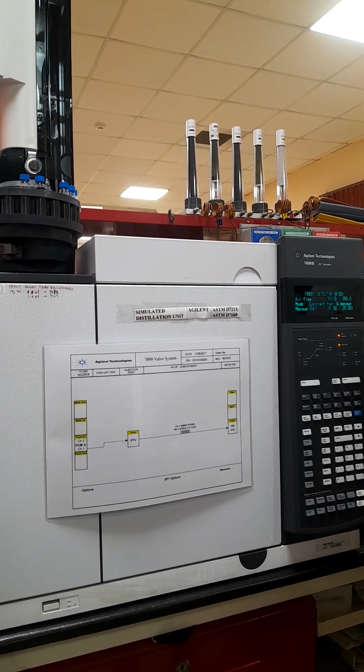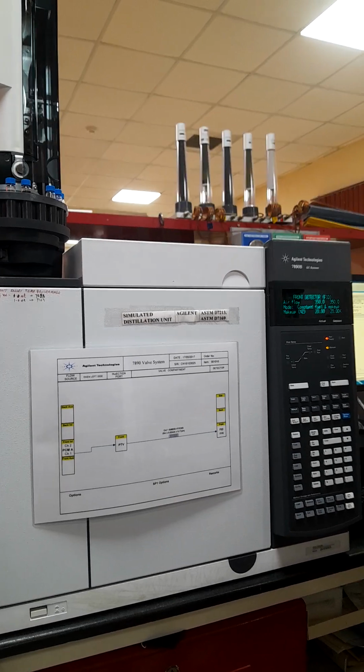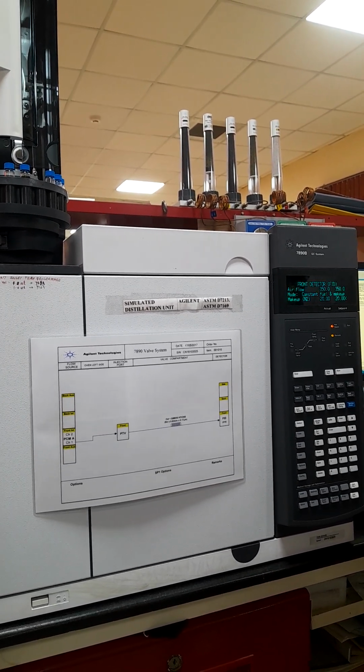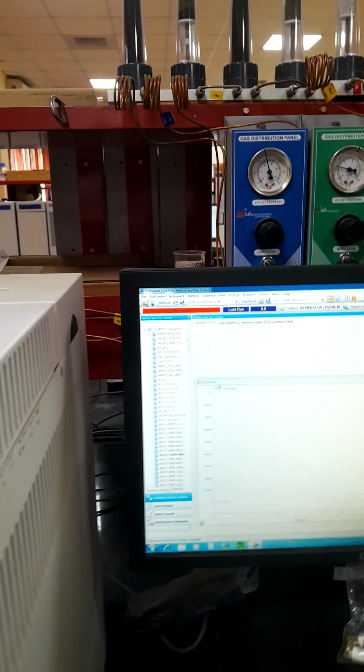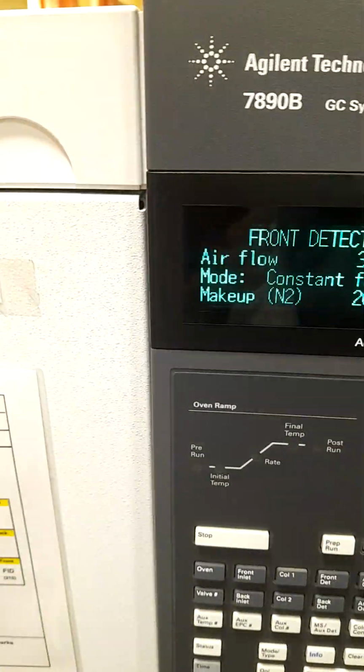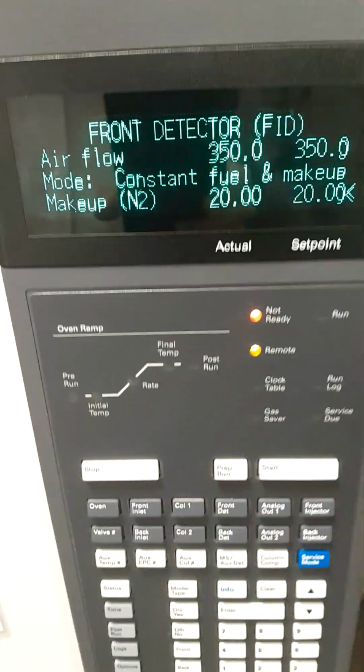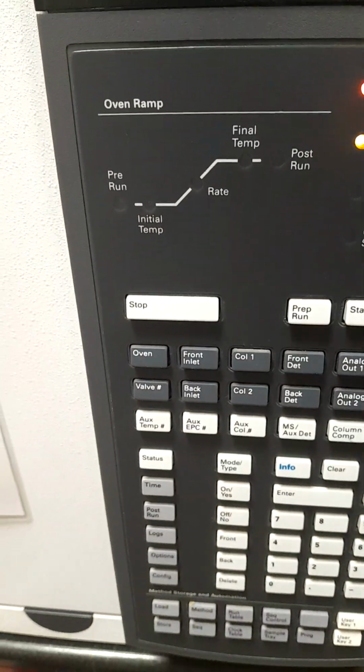Those generators come with a validation certificate that shows the output and nature of the air, and it has to be validated once a year or once in six months. Am I correct? In forensic science, everything has to be recalibrated. If your output requirement is not too much, then running that facility is quite enough, not very tough. So, concerning that point, we will trust the vendors and get a bottled cylinder first.